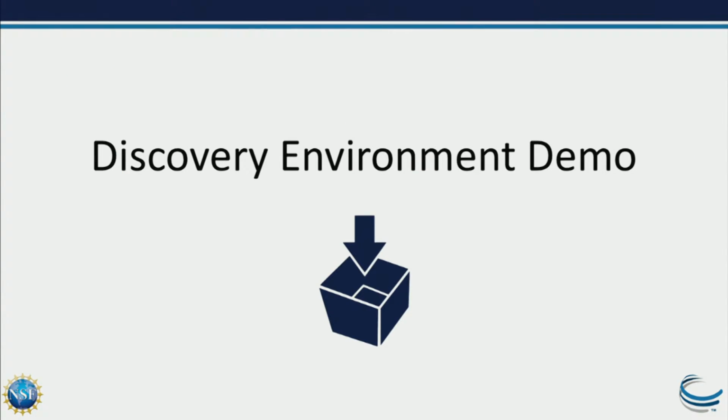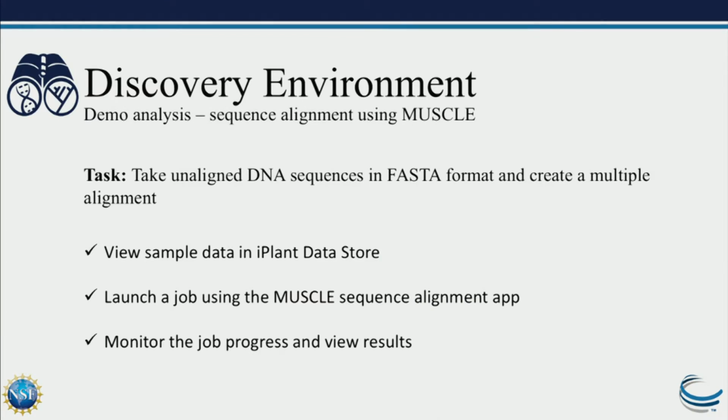Okay, so let's go into the demo. In this demo, we're going to do a really simple job, which is to take some unaligned DNA sequences in FASTA format and just do multiple alignments. That's a pretty simple job, and it's something we can complete in a moment and give you an idea for how this works.